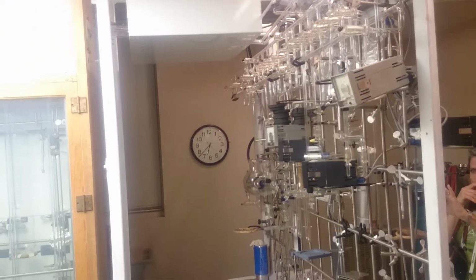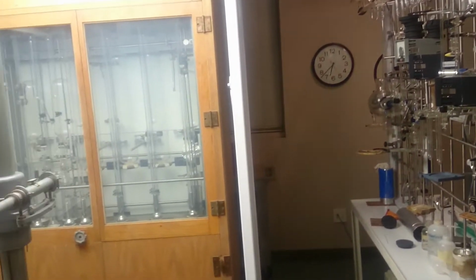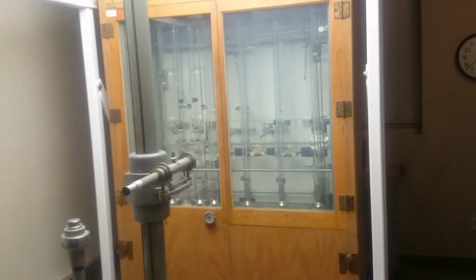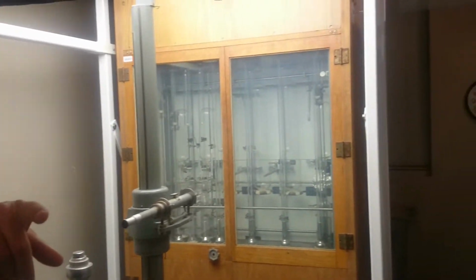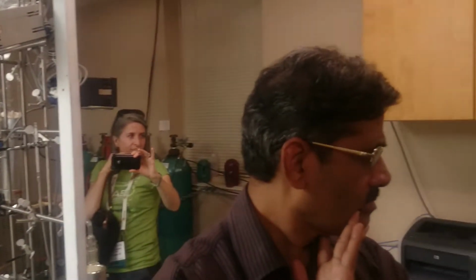But he also knew that this method that he developed, this liquid nitrogen manometry, wouldn't scale up to allow you to do a lot of measurements. And there was a lot of interest then coming from Roger at Scripps for launching this big program. So my father was brought here to run a program to measure carbon dioxide using the methods that he developed there with liquid nitrogen, but also adding another element, which is using an infrared analyzer to scale up the measurements. And one of the early infrared analyzers is in that box there.